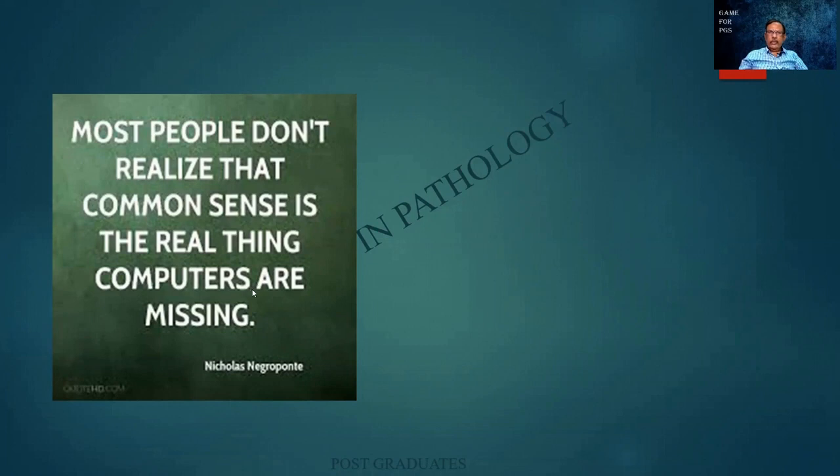In fact, you people would have seen the permutation combination that is possible. Take a specimen of intestine with tuberculosis that is given to you. There is nothing wrong if the examiner asks you, what are the differences between primary and secondary tuberculosis? What are the sites of primary tuberculosis? And so on and so forth. Hence, I would like to conclude that not only the abdomen, the small intestine is also a temple of surprises, and be prepared for such eventualities.